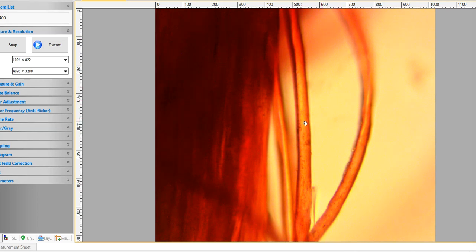Now we could look at a bunch of other things here. I kind of wanted to give you just a quick overview of what the microscope looks like. We're going to do some other work. Hey, maybe we can look at a prepared slide quick. I've got all kinds of prepared slides. Here's one we might use later. It's Pine Life History.